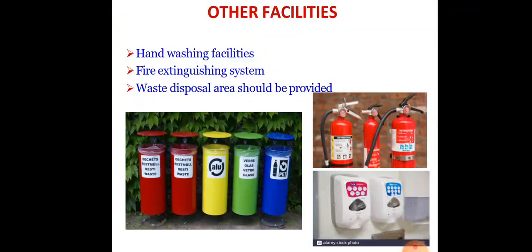And also other facilities we need to run the plant tissue culture laboratory: hand washing facilities outside the lab, and a fire extinguisher system. The waste disposal area should be provided with a different mode.